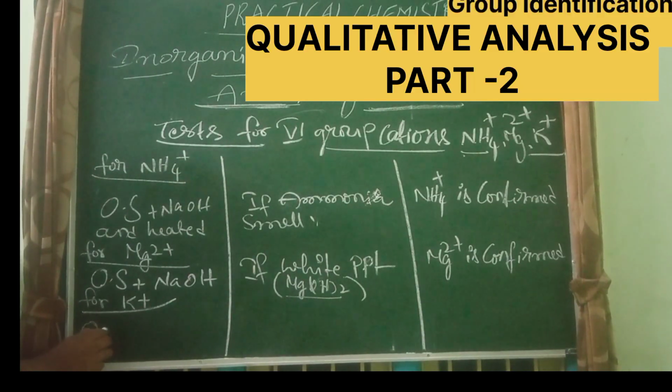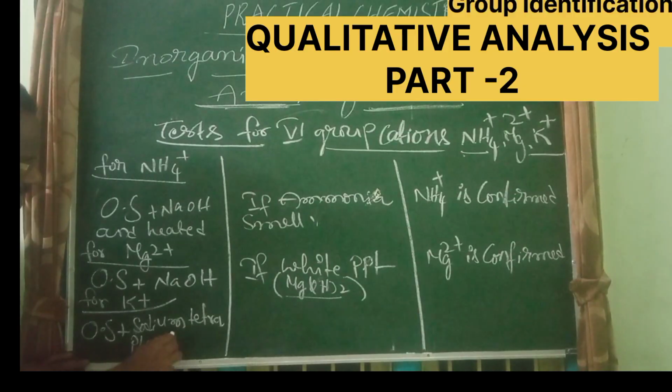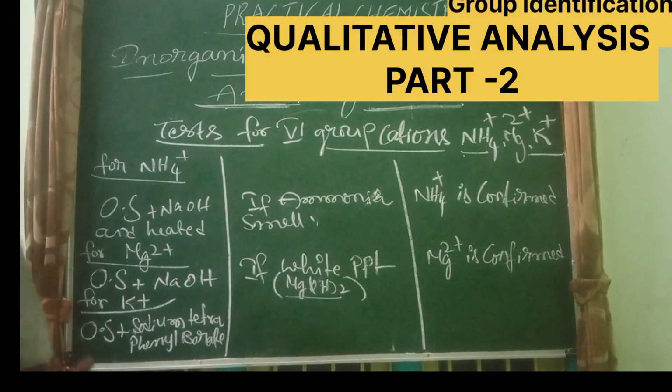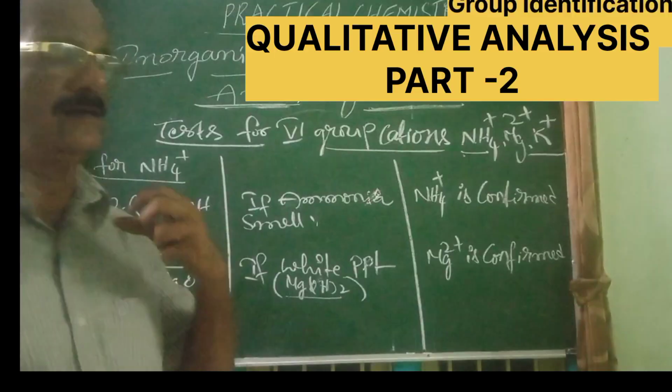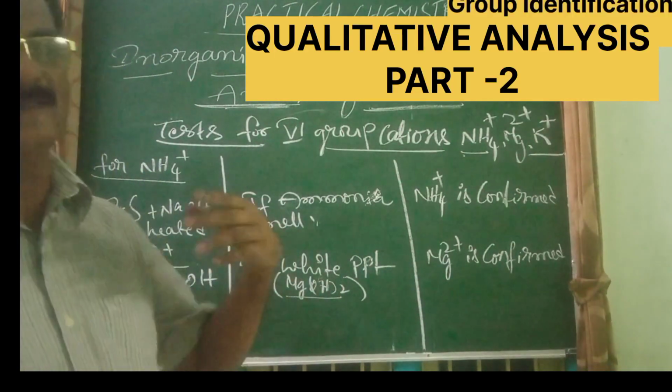So here what you have to do is add sodium tetraphenyl borate to the original solution if you suspect there may be K+ in the salt.